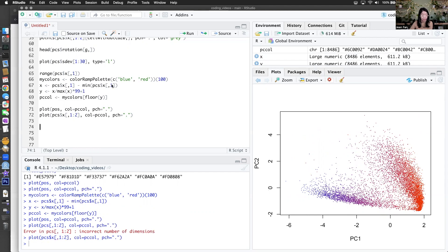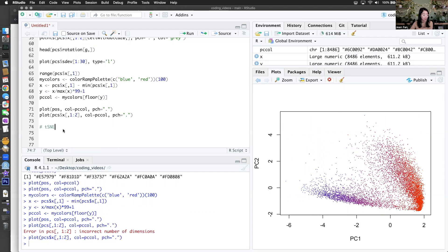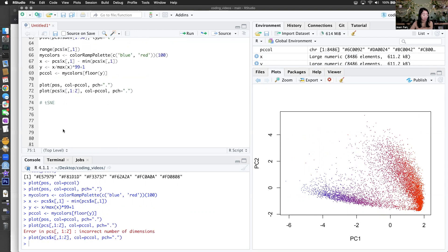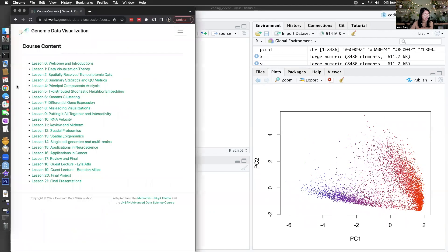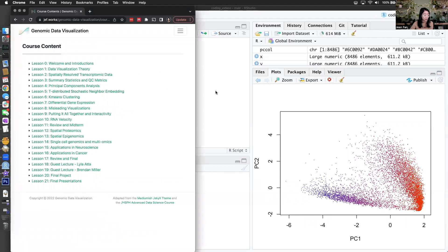We could redo this for all our PCs, but that becomes a little tedious. So we can do nonlinear dimensionality reductions to try to capture transcriptionally distinct subpopulations built on our primary analyses of transcriptional variation. So we are going to do t-SNE — t-stochastic neighbor embedding.